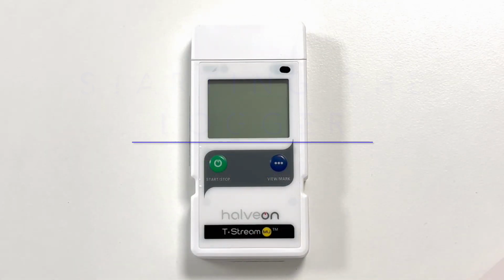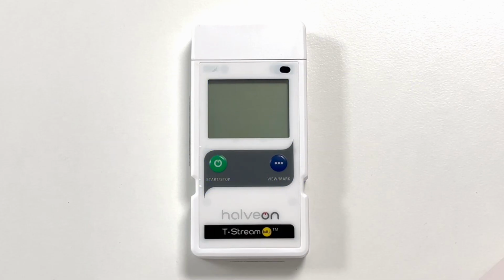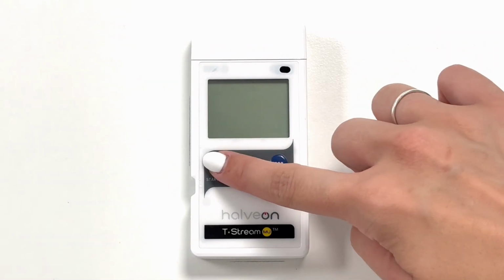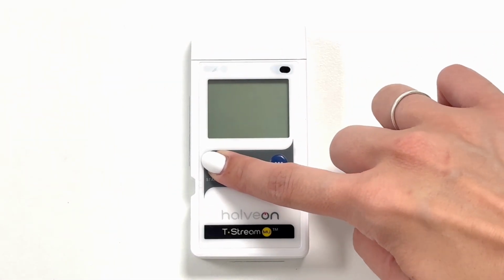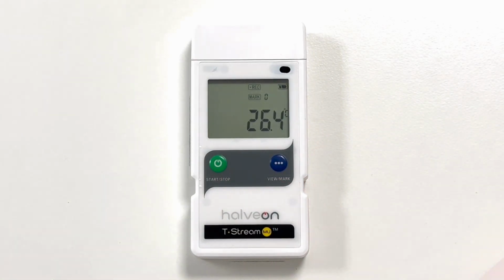Part 2. Starting the logger without a start delay. If the device does not have a start delay previously programmed with the software, press the Start/Stop button for more than 4 seconds. The LCD screen will show directly REC, which means the logger has started recording successfully.